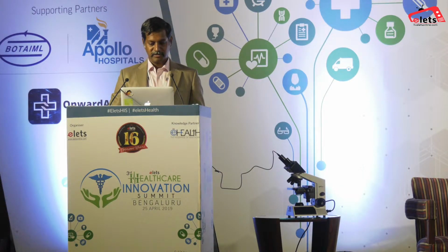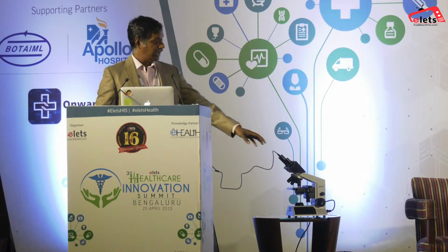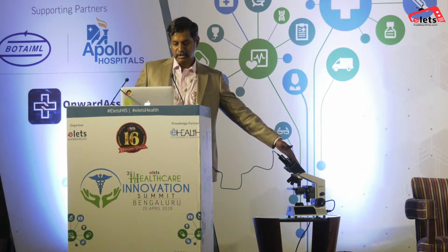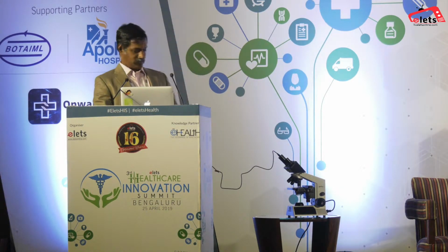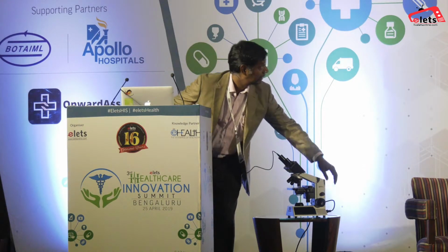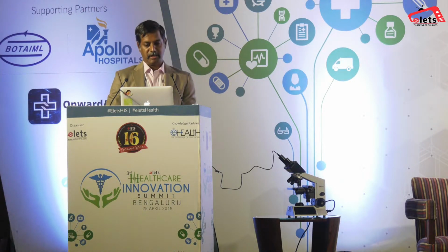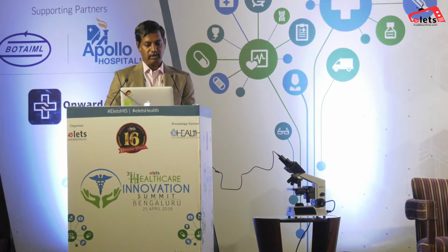Right. So in this case, we actually have a microscope sitting right here, and what we've basically done is connected that to the system here.